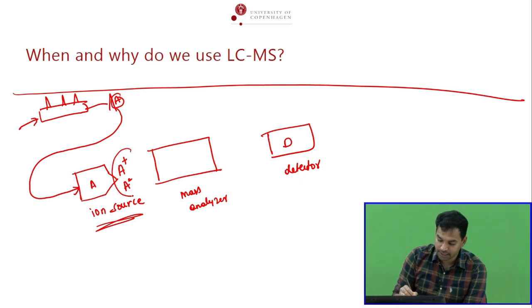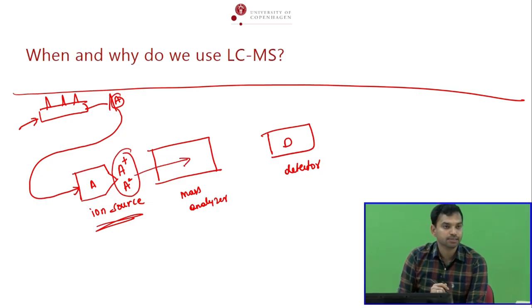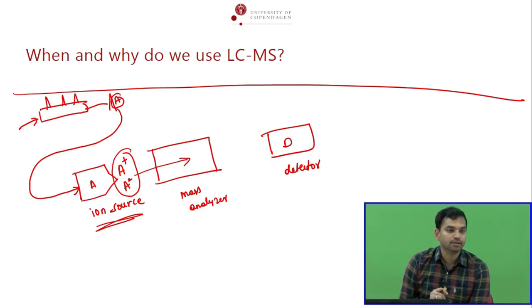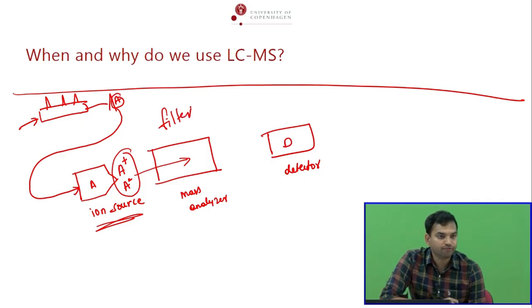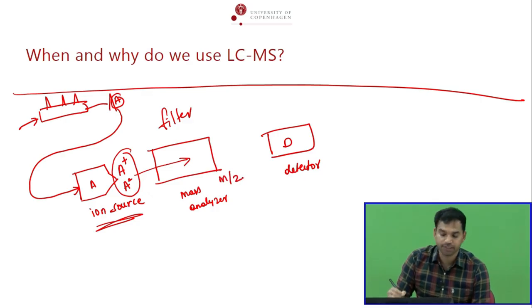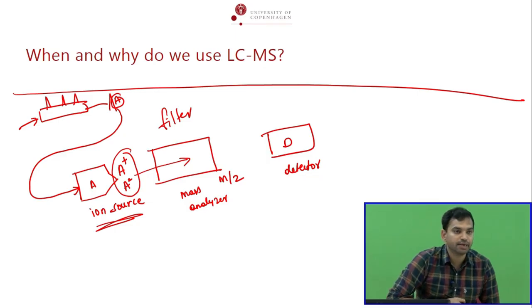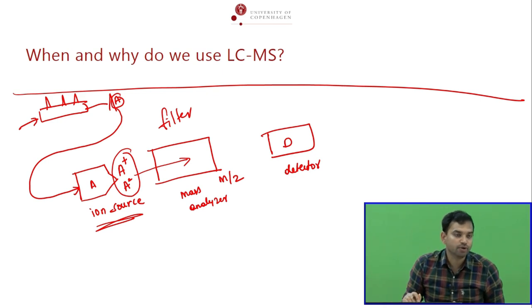Once it is charged, it enters the mass analyzer. The mass analyzer is basically a filtering system. It filters ions based on their mass-to-charge ratio, m/z. I'll explain that in the next slide. So that's the job of the mass analyzer.